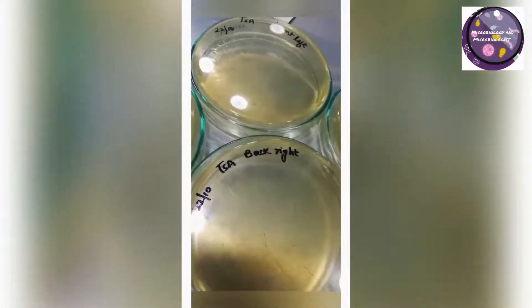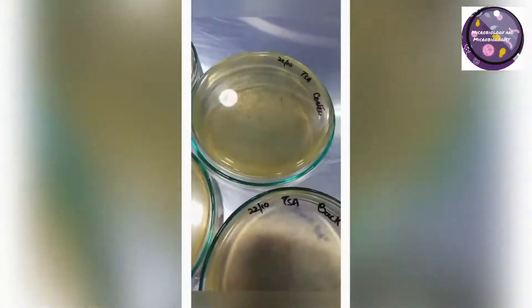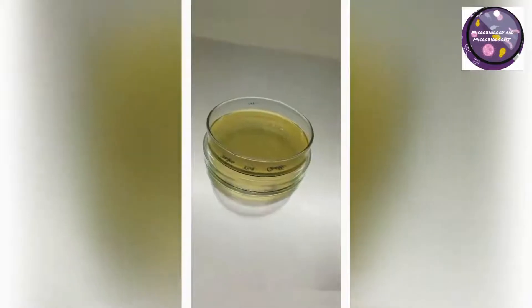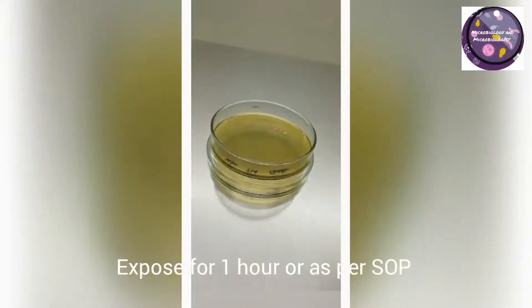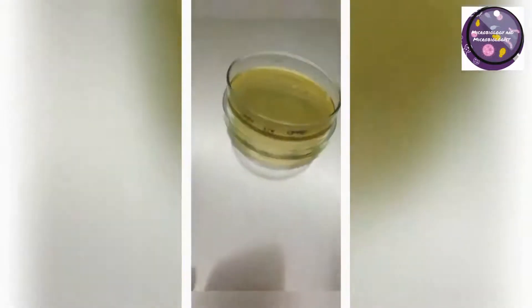Now expose your plate on the inverted lid at the same location which is mentioned on or already marked on the plate. Expose for one hour, or if you have your own SOP, work accordingly.